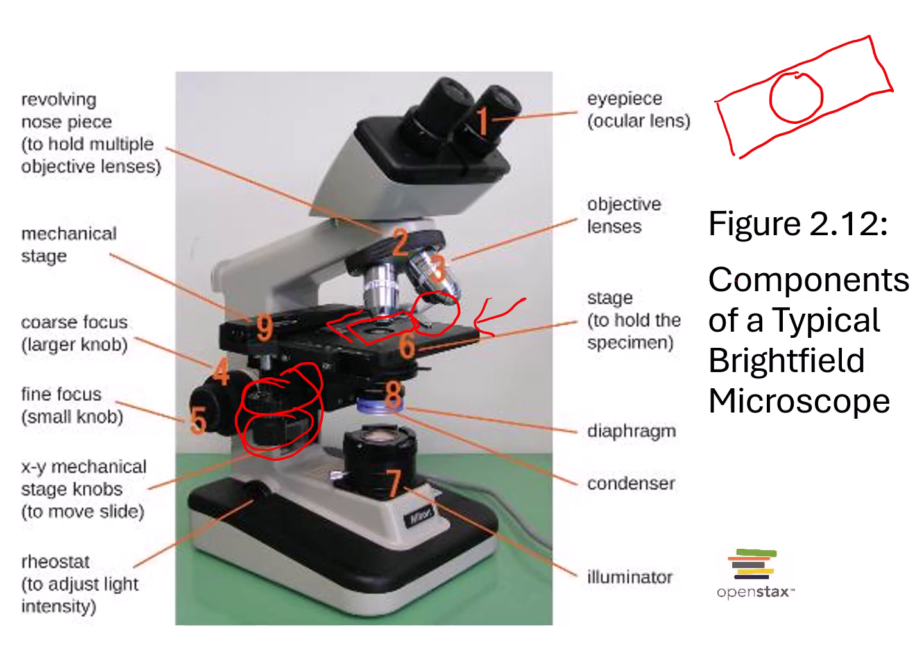When you're using the microscope and you're starting to focus your specimen, you're going to use coarse or fine focusing knobs. We usually start with the coarse focus or the coarse adjustment knob for these lower objective lenses, either the 4 times or the 10 times objective lens. These are going to be the shorter objective lenses that are found on your revolving nosepiece.